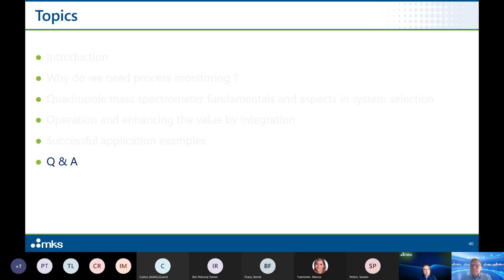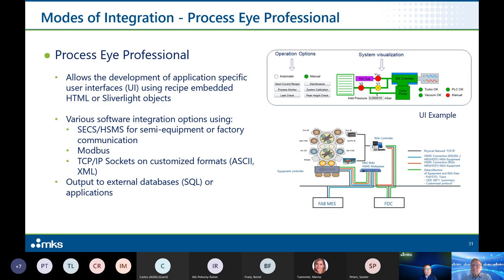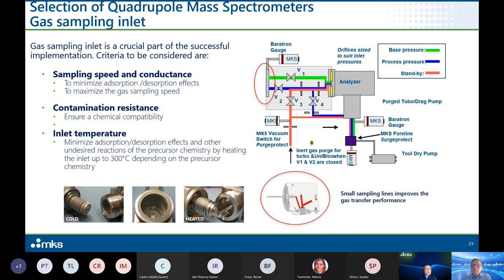The approach is often considered to use single orifices. I go back maybe a few slides in my presentation. Yes, that one. Look at this blue path. Consider this is atmospheric pressure, can be atmospheric pressure. And what in theory you could do, it would be sufficient to put just one orifice here at this position to reduce the atmospheric pressure down to 10 to the minus 6. And that would be a very, very small orifice. And I do agree, there's a high risk of blocking the orifice if something goes wrong and you're creating some particles, or some particles will be going into the inlet stream.